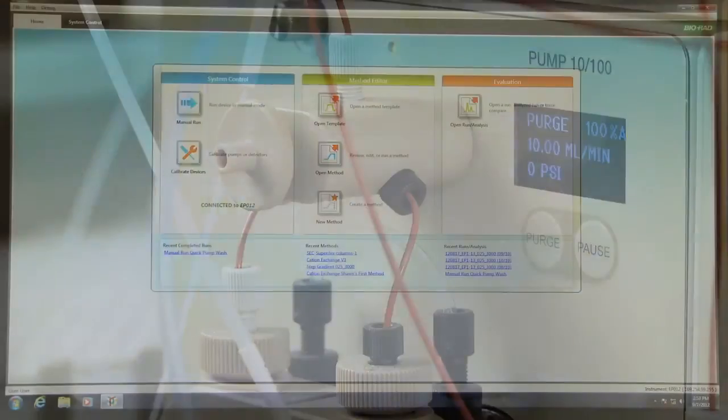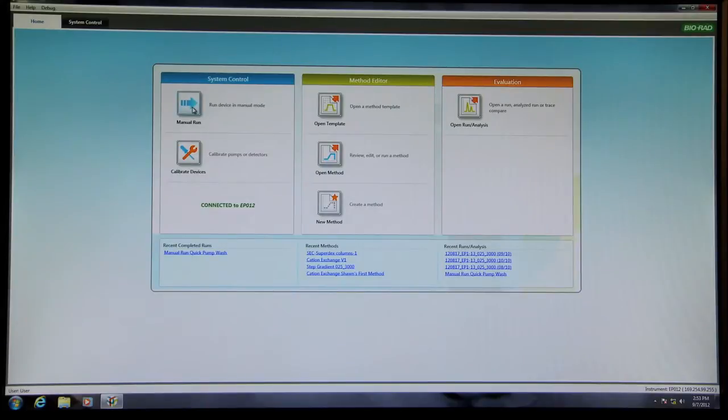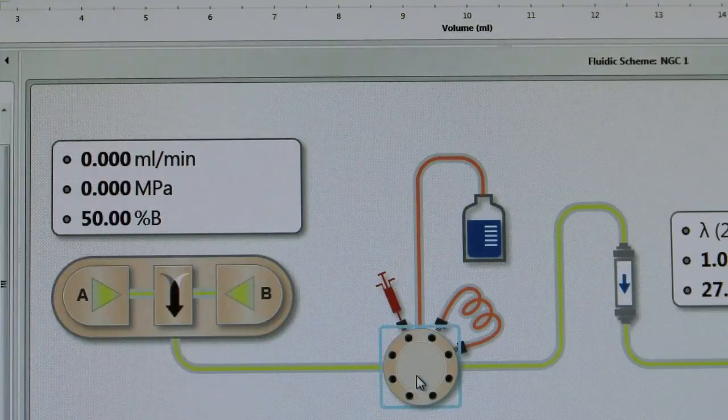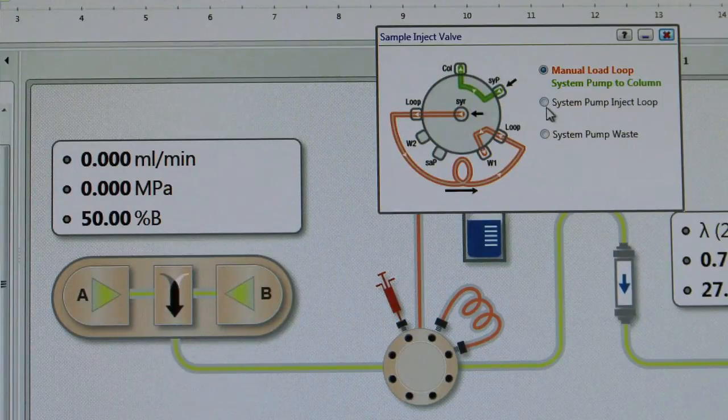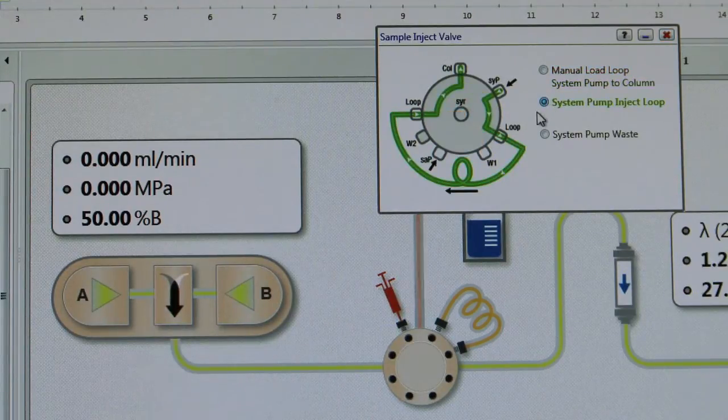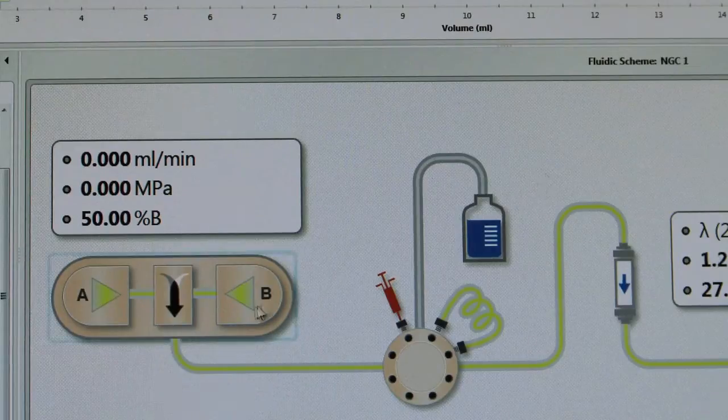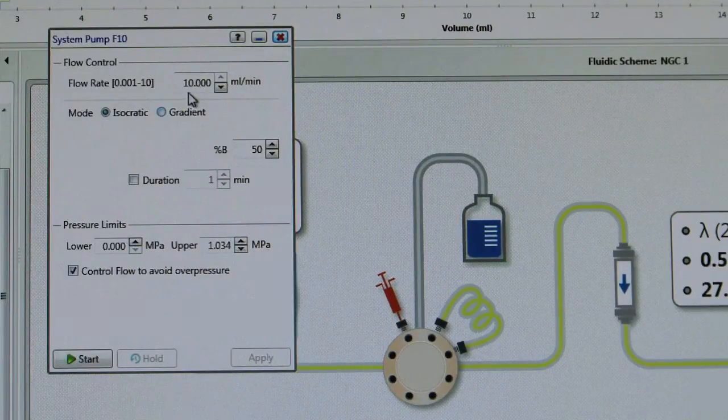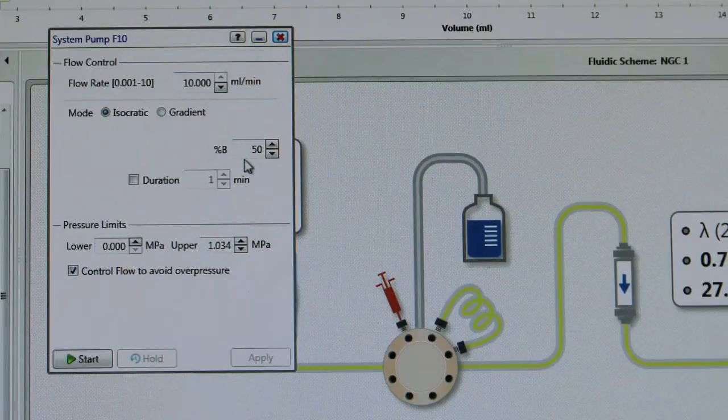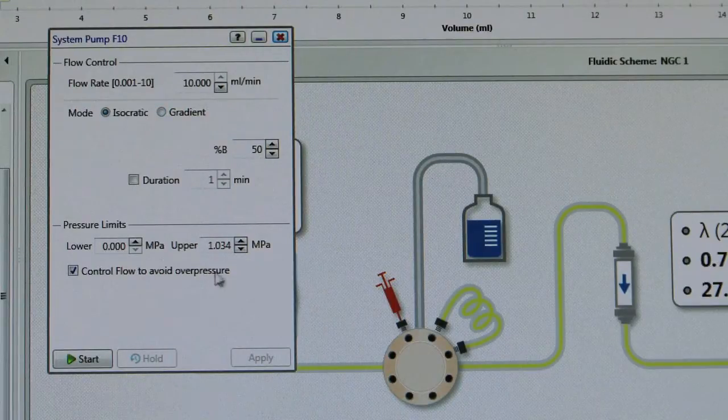To purge the system using ChromeLab, launch the software and select Manual Run on the home screen. Double-click the pump icon. On the software pump faceplate, set the flow rate to the maximum flow rate of the pump. In the case of the F10 pump, choose a flow rate of 10 milliliters per minute. Set %B to 50%.